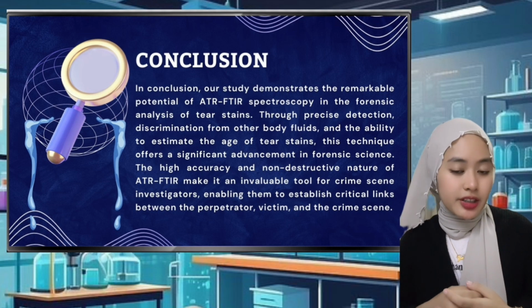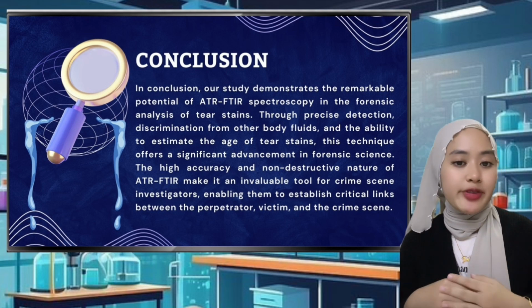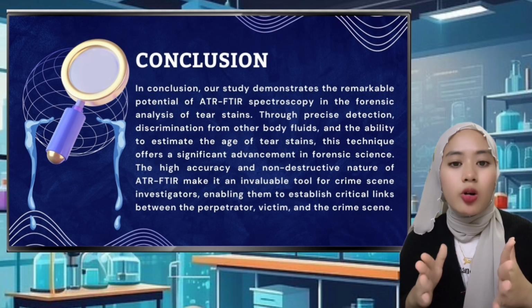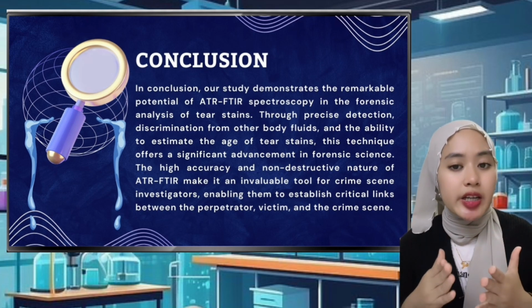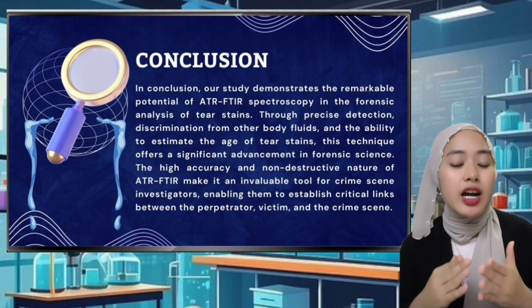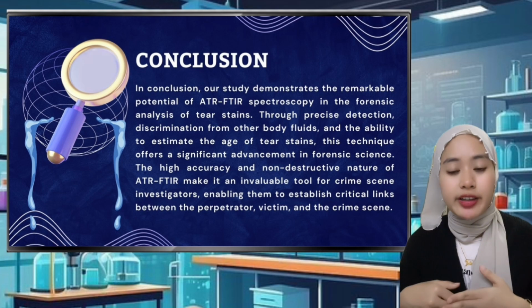As for conclusion, the identification and discrimination of rarely found body fluids at the crime scene are as important as for the other common ones such as blood, semen, and saliva. In the present study, tear stains were identified and discriminated from the IR spectra of other commonly found body fluids: blood, semen, saliva, and urine.